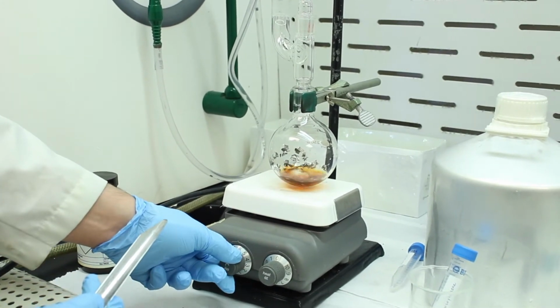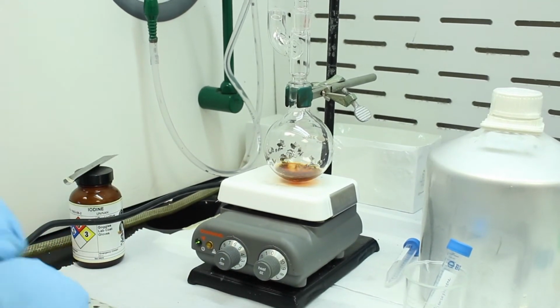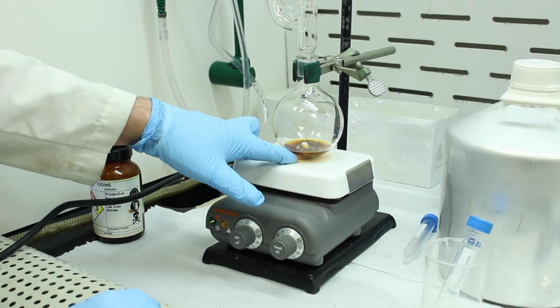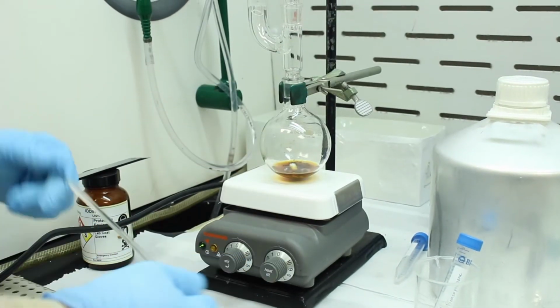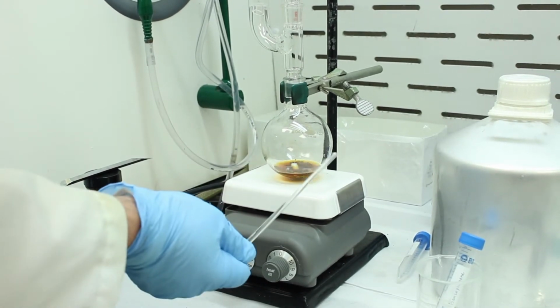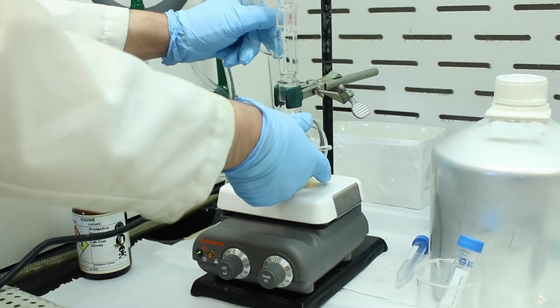Okay, so hopefully this helps initiate the reaction. Alright, so we've added our iodine. It's stirred for a few minutes, but it's still being pretty stubborn, which can be typical. So perhaps the most foolproof way is to simply take a stir rod and jab at the magnesium, crush it, expose new surface of the magnesium to help it go. So that's what we'll do.